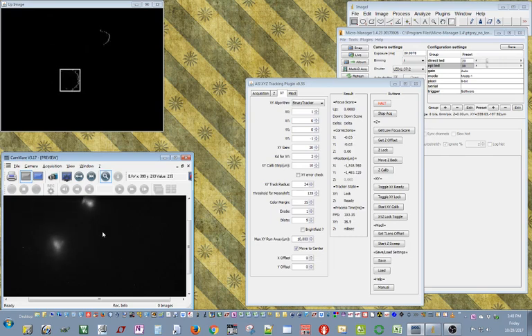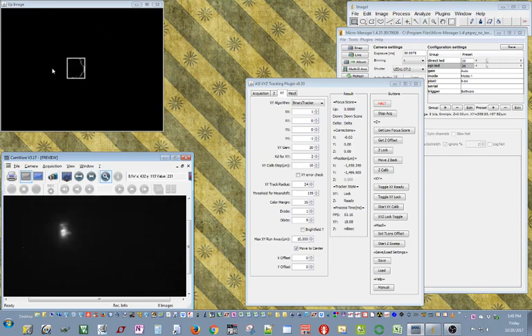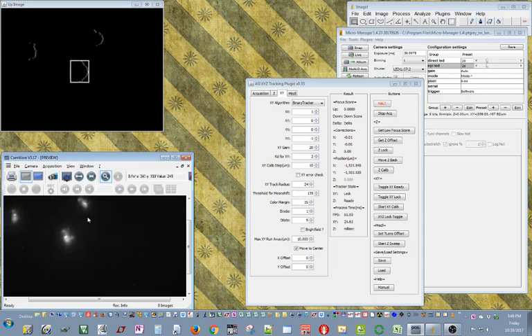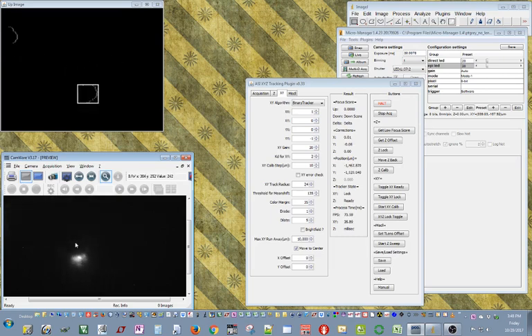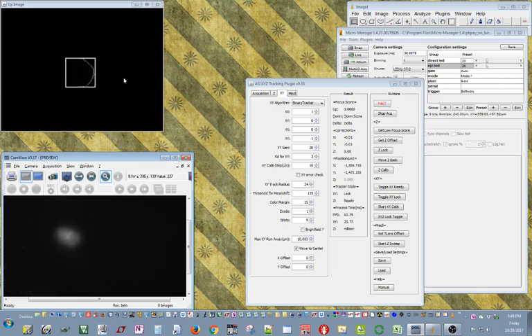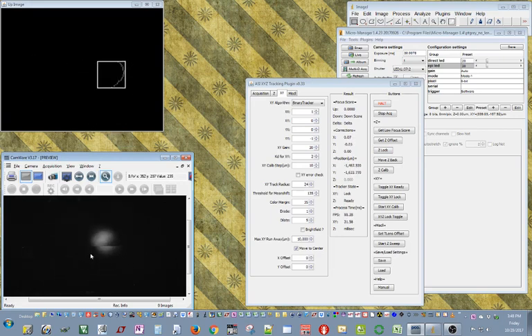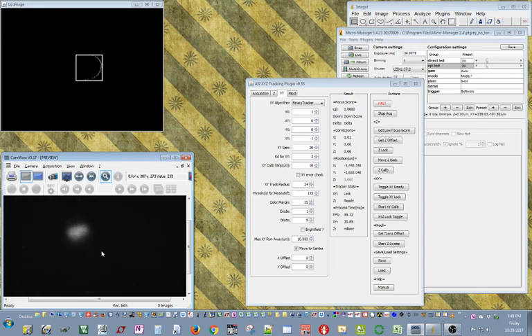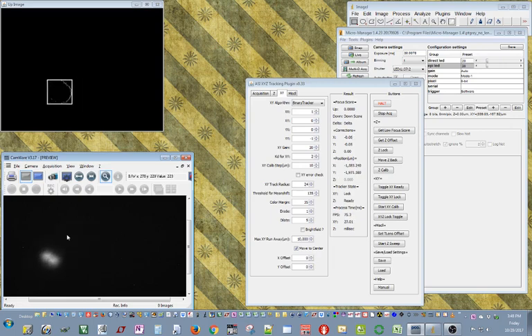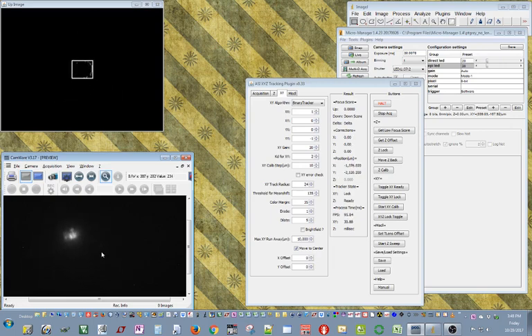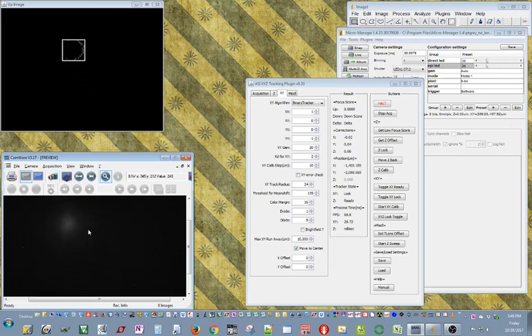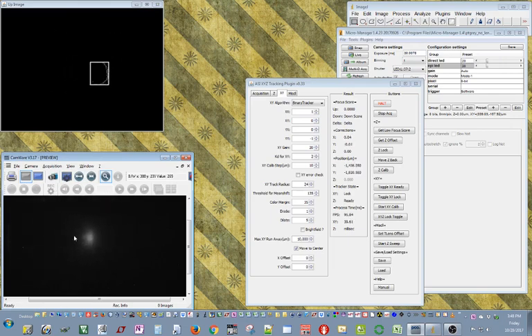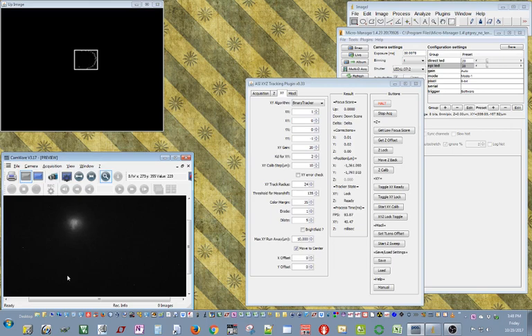There you go. This routine is actually pretty robust that, say, as you see, the size of the rectangle is changing and it's scaling depending on what the size of the blob is. I'm going to intentionally move my focus knob. So I defocus the image, make it as blurry as possible. And as you see, it's still tracking, still tracking, even with this blurry of an image. So it's not as sensitive to Z drift as possible. At some point it's going to lose it. But yeah, check that out. It's so faint. I'm still able to track it. Bring it back to focus and go the other way now. See that? It's so faint. And binary tracker is still working. It's still able to pick out a blob in this blurry image and it's tracking it.